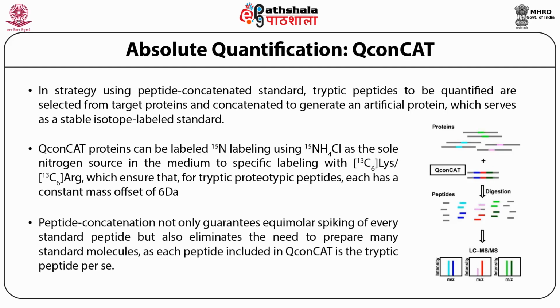Peptide concatenation not only guarantees equimolar spiking of every standard peptide, but also eliminates the need to prepare many standard molecules, as each peptide included in the QconCAT is the tryptic peptide per se.